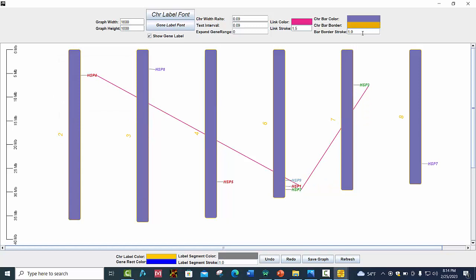You can also change the bar border stroke size — for example, selecting 2 and refreshing it. Similarly, you can also change the chromosome label color.